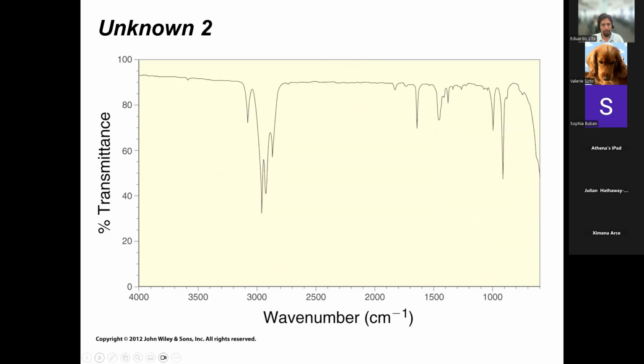Alrighty. I think there's a few more practice problems. Ooh, this one is nice. What about this one? What do we see or do not see here? This one's a bit too simple in terms of lines. We don't see many lines. We don't see many signals, right? That's already one big hint.